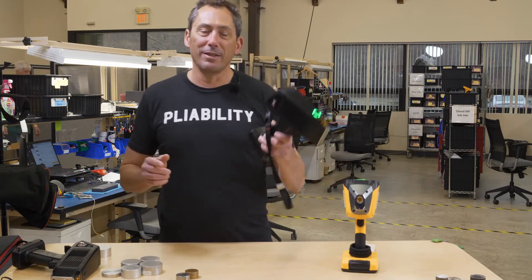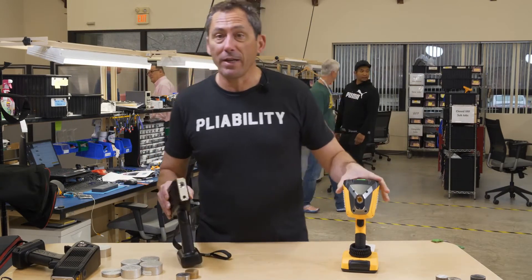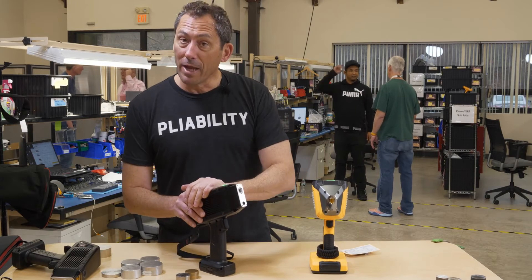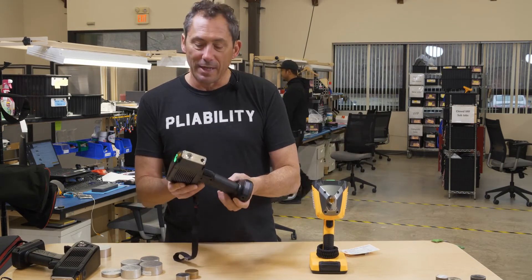Hey, I'm Don Sackett, CEO and co-founder of SciApps here in Woburn, Massachusetts. So we've been talking about our XRF analyzers. We've been talking about this brand new X550 — it's a premium model with this luxury design.